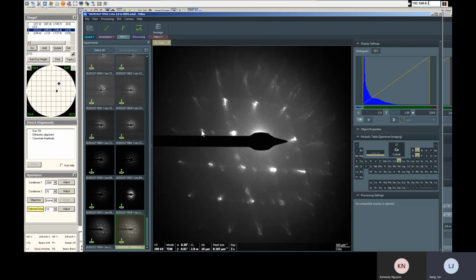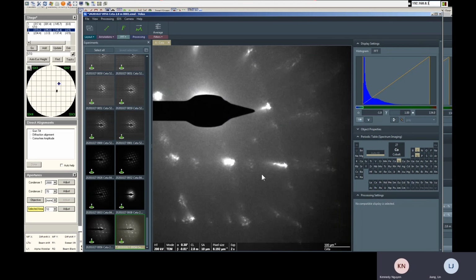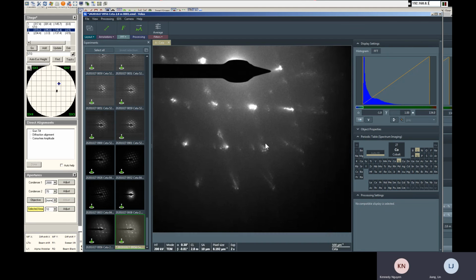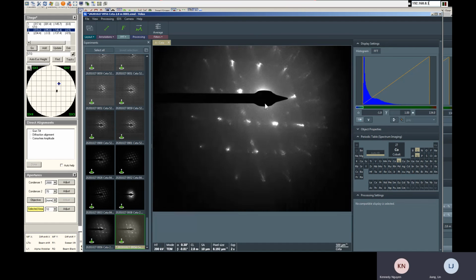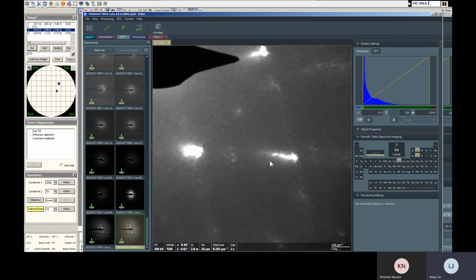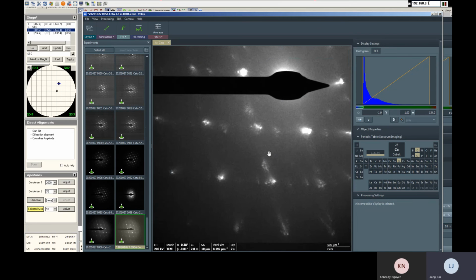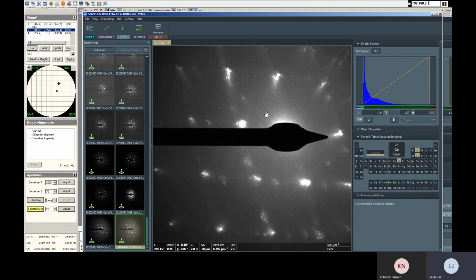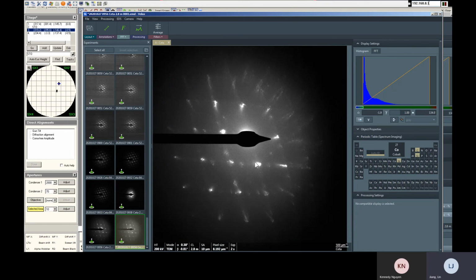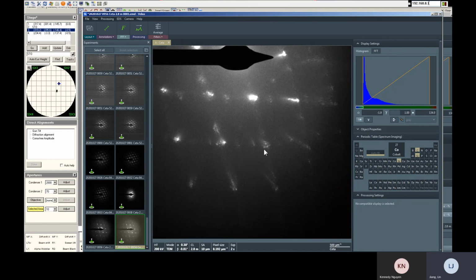So right now it's fine. You don't have stigmatism in here. It looks like a sphere though, right? Yeah, look at the sphere. So you can try on your microscope, because this one we probably need to redo the advanced alignment, because something is going on and it's supposed to look a little bit better.